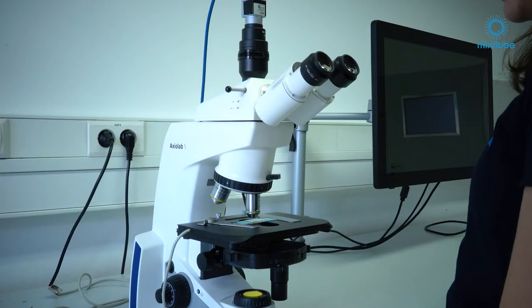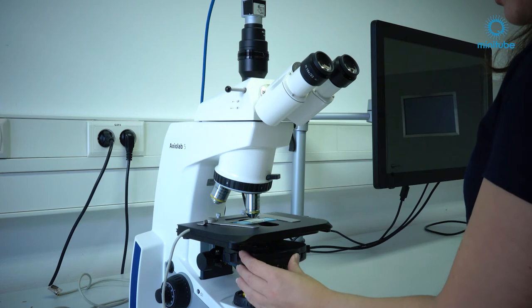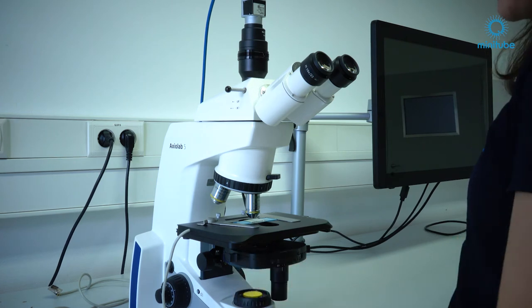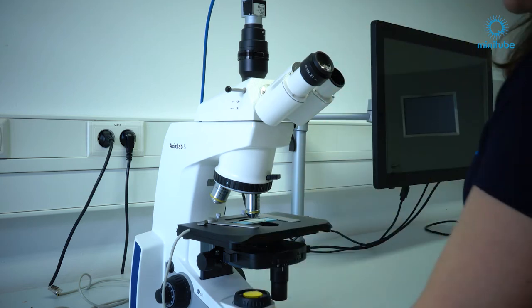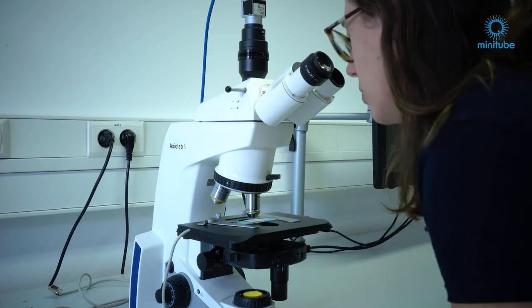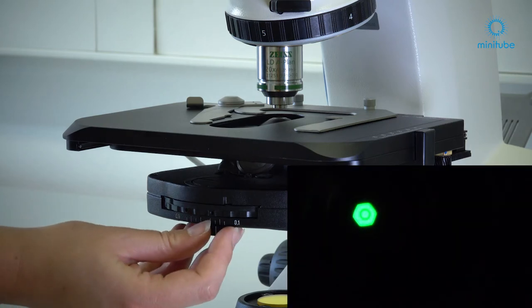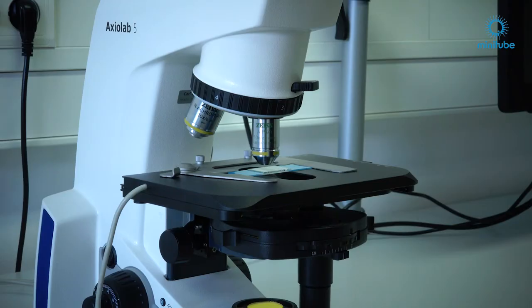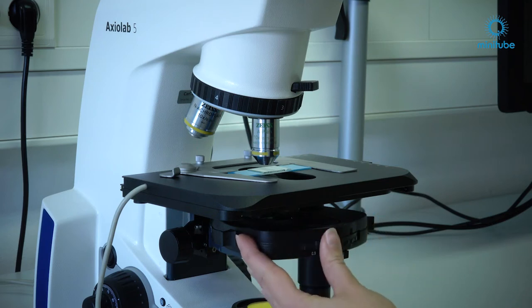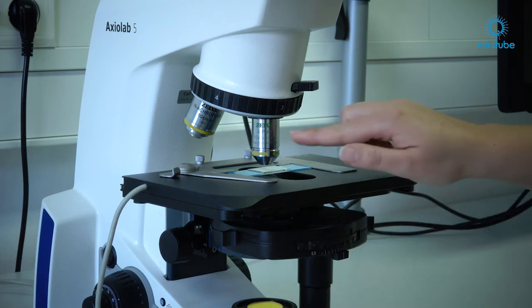To adjust the aperture set the condenser to bright field and take an eyepiece from the tube barrel and look through the barrel. Open the aperture to a size of approximately 70-80% of the area of view. Now switch the condenser back to the appropriate phase.